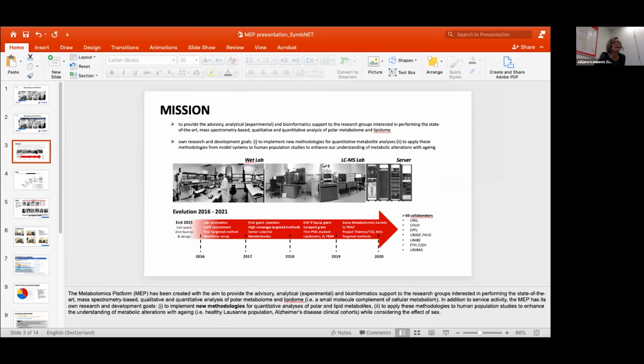Feces is usually lyophilized prior to metabolite extraction, and then we are reporting the metabolite concentrations to the dry weight. There is an intention to correlate the gut microbiome diversity to the metabolic signatures of feces, in the context of Colaus.